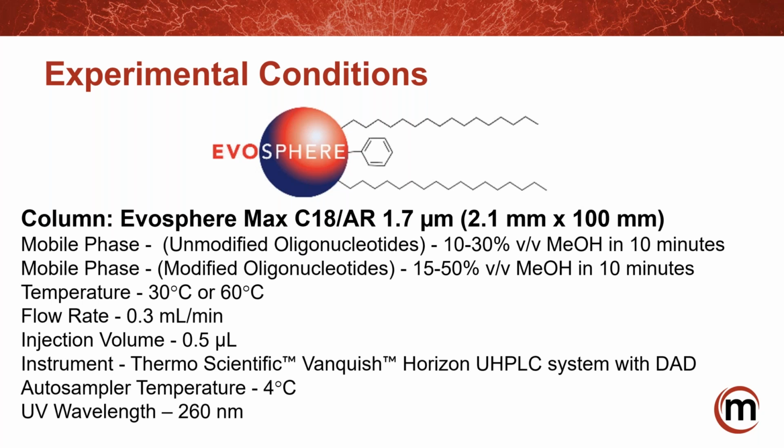So you're getting a lot of power out of the LCUV side, where you can do early reaction monitoring. Say you have multiple backbones in the same sample, so they update the backbone or make modifications. You could have side reactions that they have to deal with, and so then obviously the mass spec. Those Orbitraps and those really high-res mass specs or Bruker systems are really the de facto standard there, and that's what they'll end up doing.